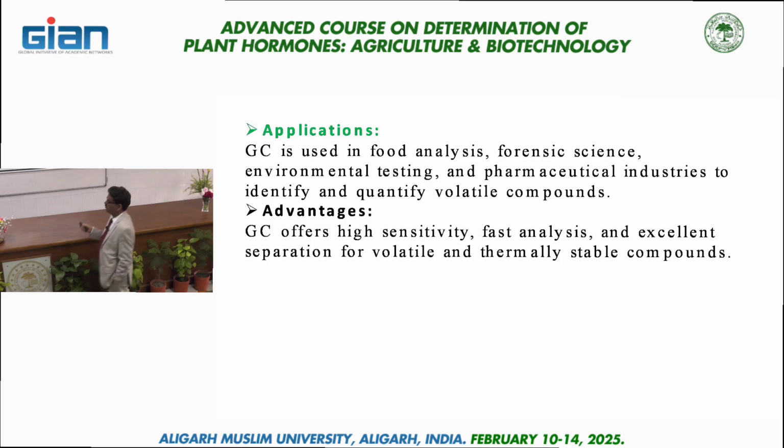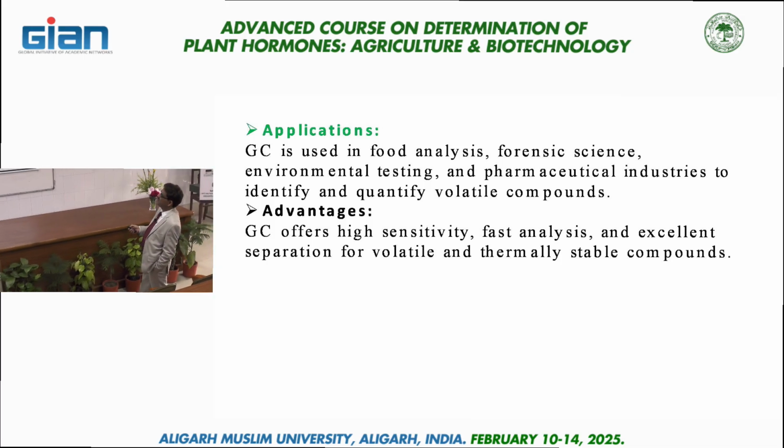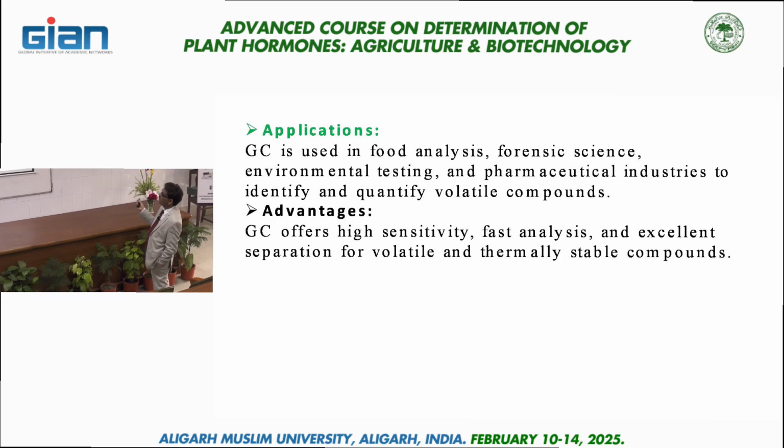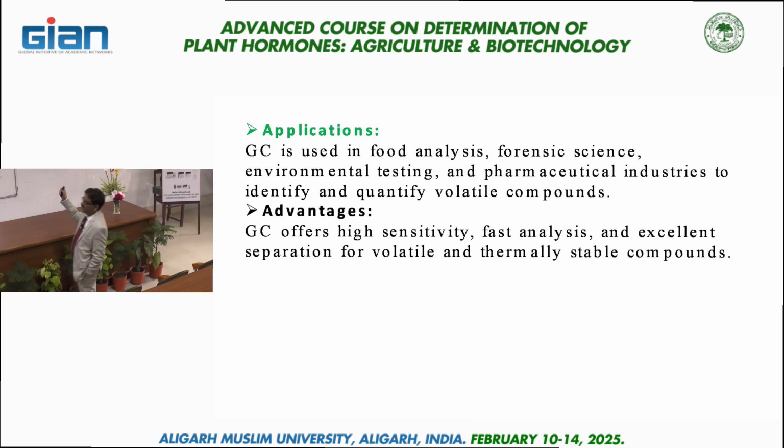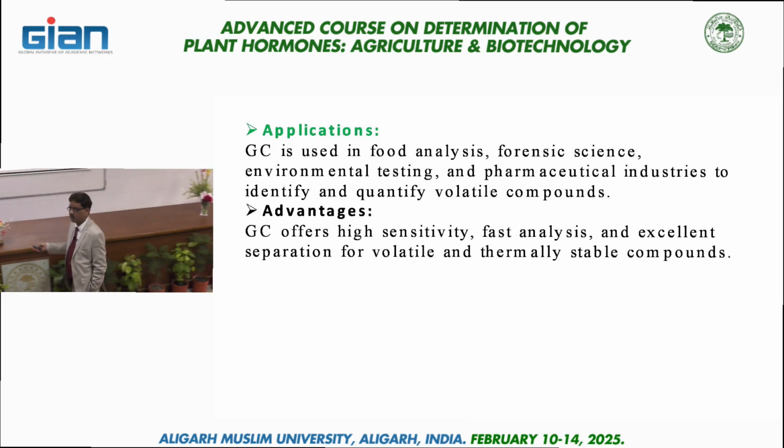Okay? Then what are the advantages we have? That the GC offers high sensitivity, fast analysis, and excellent separation for volatile and thermally stable compounds. Okay.